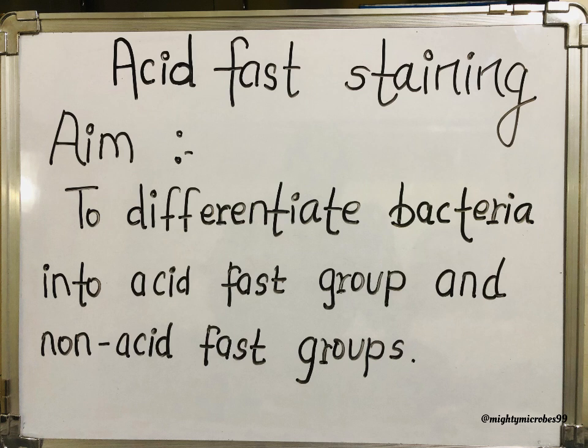So the aim of this acid fast staining is that it can differentiate acid fast bacteria from non-acid fast bacteria.